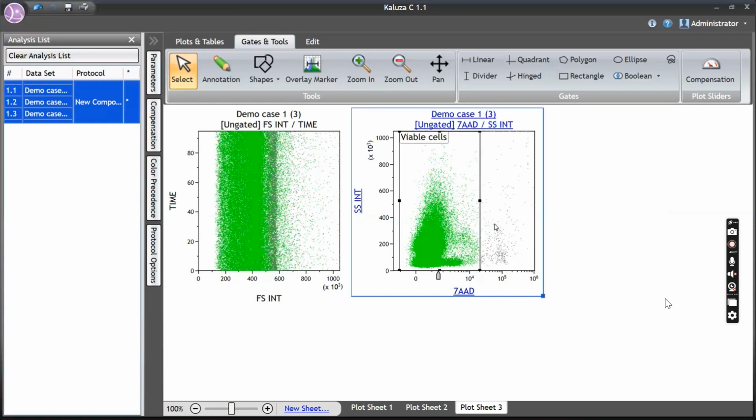So when it is a locked protocol, or even when the protocol is already established and it's going without any supervision by your technician, you should have a look at whether the gates are all perfect and things are all fine. Because when this goes wrong, then things will be very bad. So you should always have a check on it.